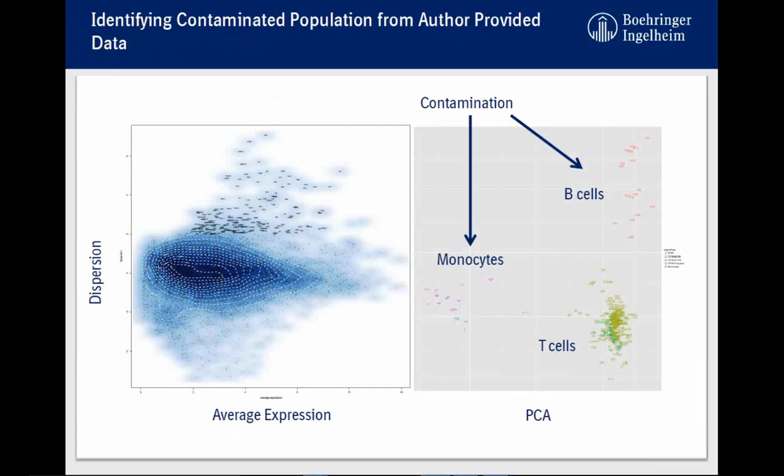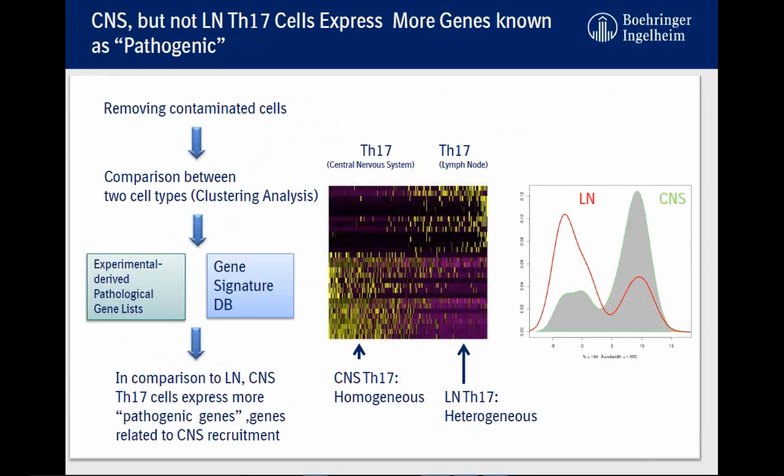We look at the most variable genes from these samples. So here's the plot for average expression versus dispersion. So you can find the variable genes, and the PCA plot is another very powerful method that many people use. In this setting, we were surprised at the beginning. It surprisingly behaves really well. How come in Th17 T cells I have distinct populations working so well? Oh wow, we found it.